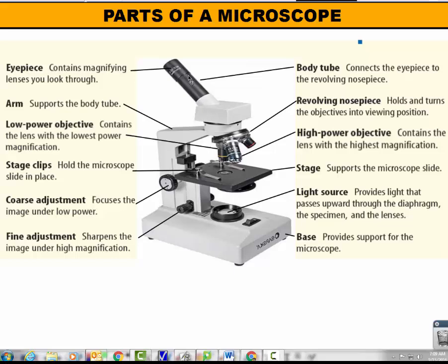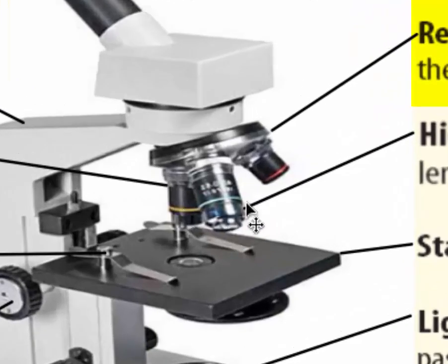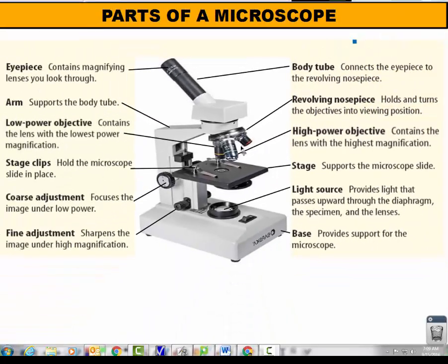Next, underneath the eyepiece we have what's called the body tube. The body tube just connects the eyepiece to another piece called the revolving nosepiece. The revolving nosepiece is important because this is the part of the microscope that has the three objective lenses. The three objective lenses are going to be the lenses that help magnify an object so you can see it through the eyepiece.